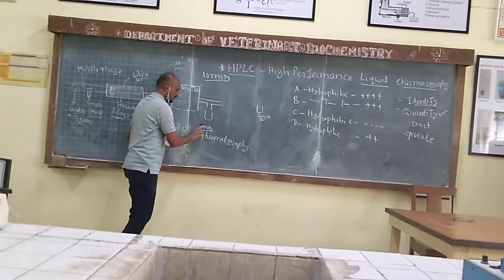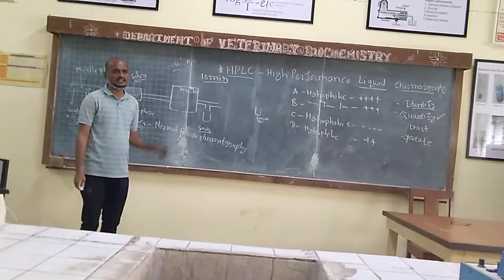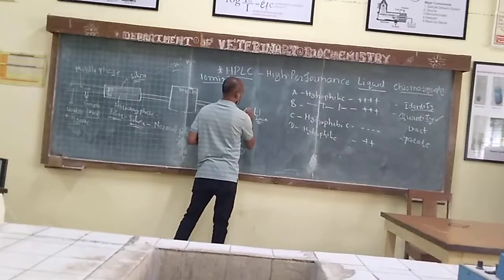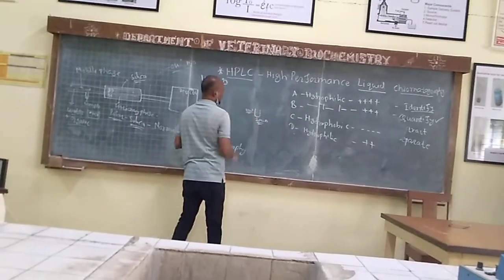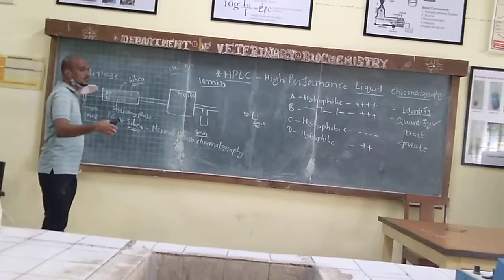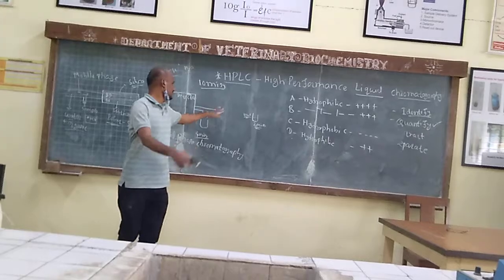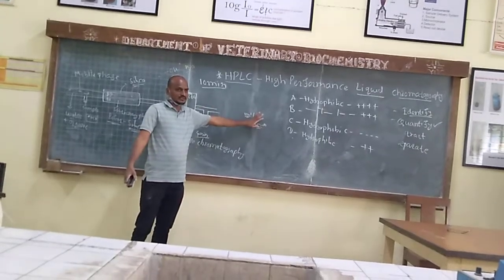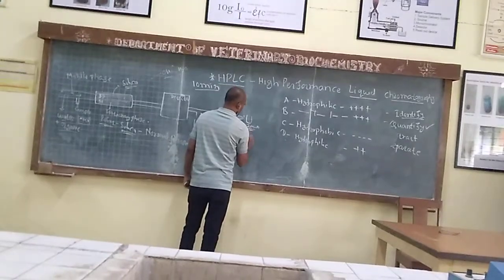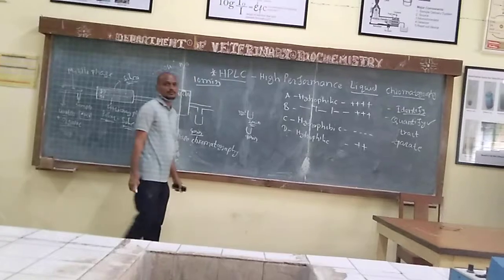Now it is how many minutes? 4 minutes. After 4 minutes, we are collecting some 1 ml sample. For example, you are collecting 1 ml. Okay. So basically, the flow rate is how much sample passes per minute. But 1 ml sample we have collected. For example, after 2 minutes. After 4 minutes, we are collecting again sample we have collected after 4 minutes.